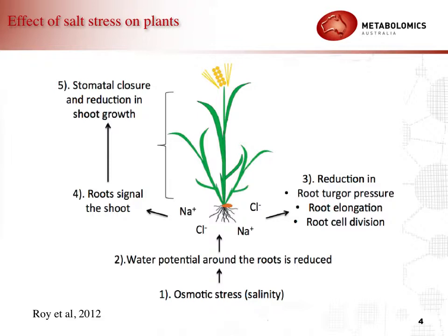However, some plants can tolerate the osmotic stress and show resistance to salinity and grow well in the presence of salt. Here we are investigating the salt tolerance mechanism in plants, and we are using the lipidomics platform to find out the defense mechanism in barley roots.